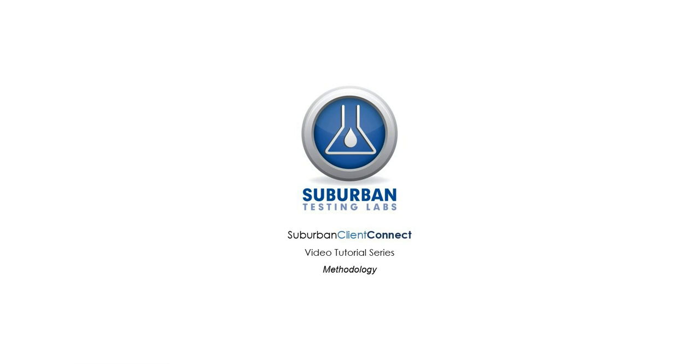Today we're going to discuss the methodology section of our online report access system, Client Connect. So let's get started.